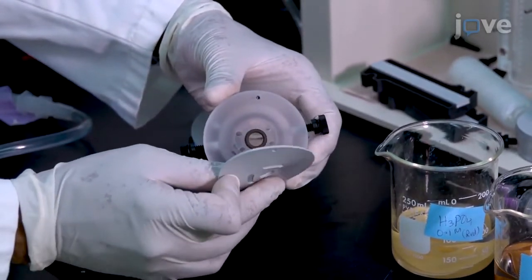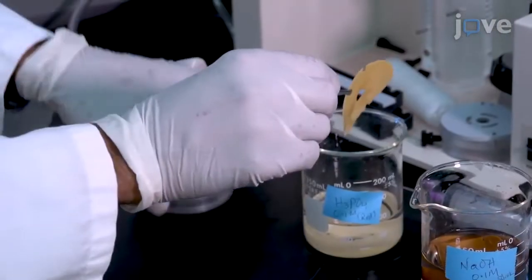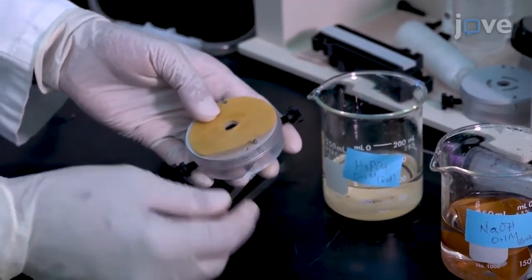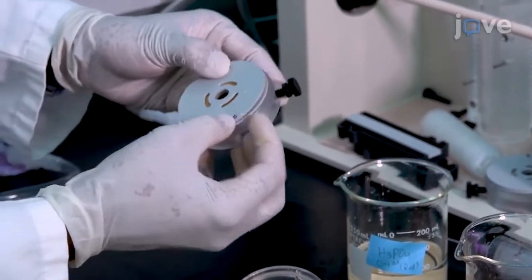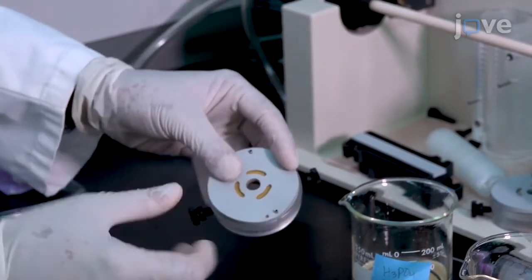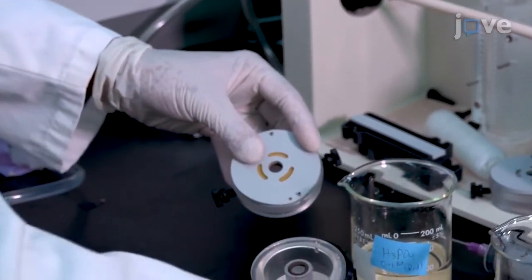Assemble the inner and outer portion of the electrode by aligning the three oblong holes in the ion exchange gaskets. Then fill the electrodes with their respective electrolytes to prevent their membranes from drying out.